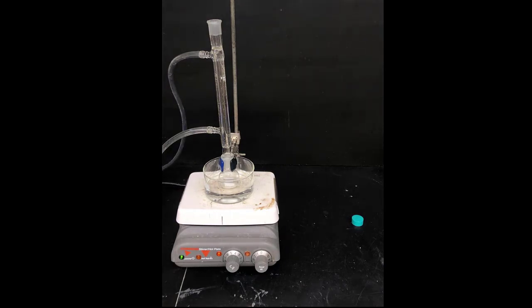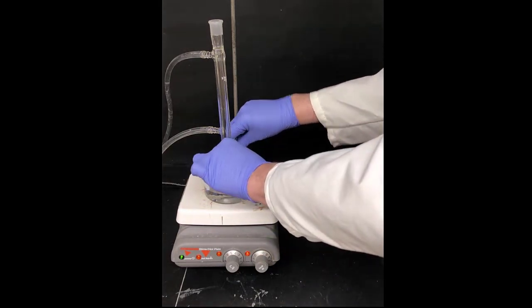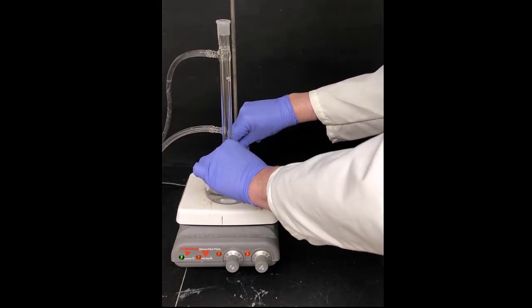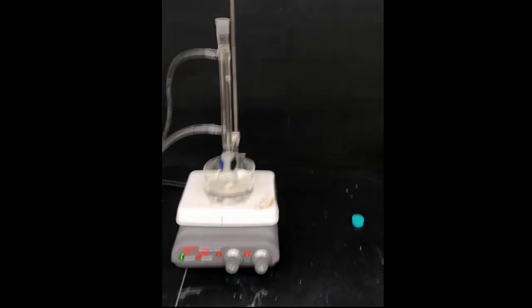The point of a reflux condenser is to keep solvent in the apparatus. In refluxing, we want to make the solution hot to get the reaction to go faster, but we don't want to lose the solvent. The reflux condenser will capture solvent and allow us to keep it in the vessel.